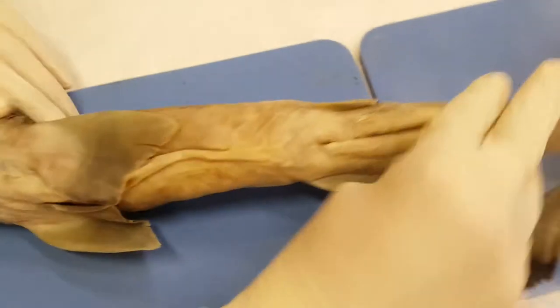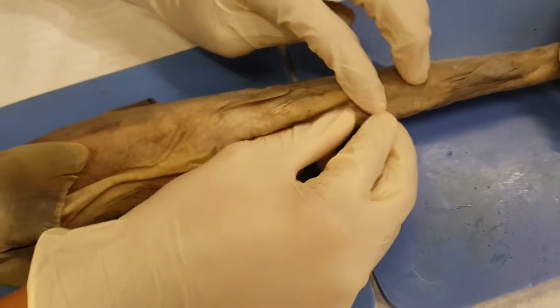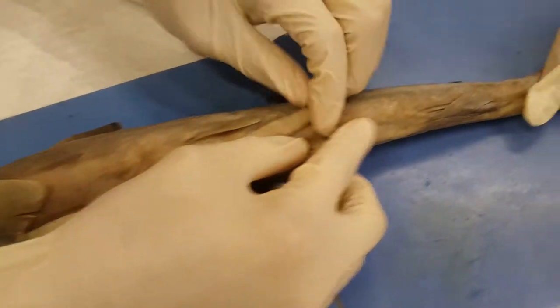After that we have the claspers right here, which is basically the male shark part that helps him with reproduction.